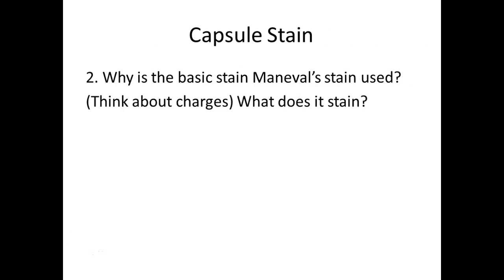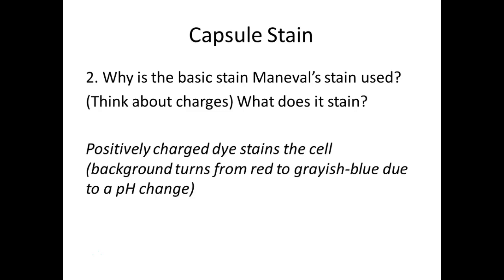We've got to use the basic stain, the Maneval stain. This is positively charged. It's going to stain the cell, right? And it will interact with the background, so the whole slide will change color. It'll be this kind of grayish blue color.